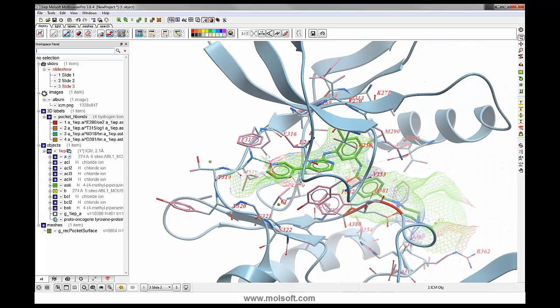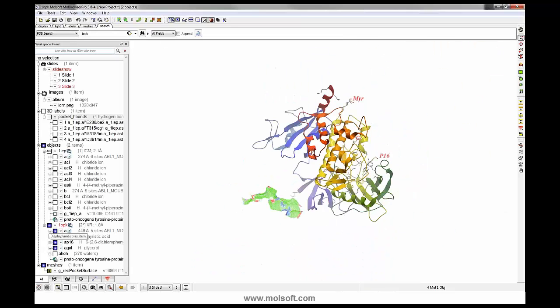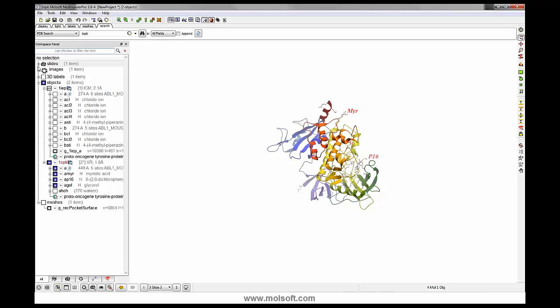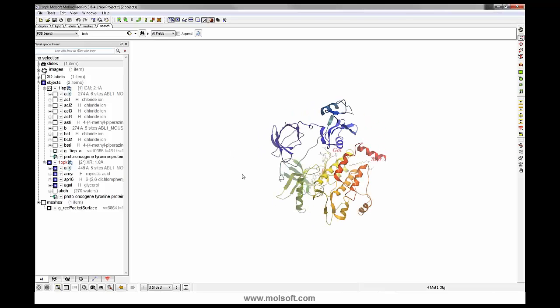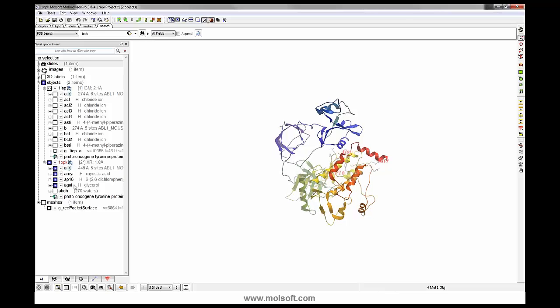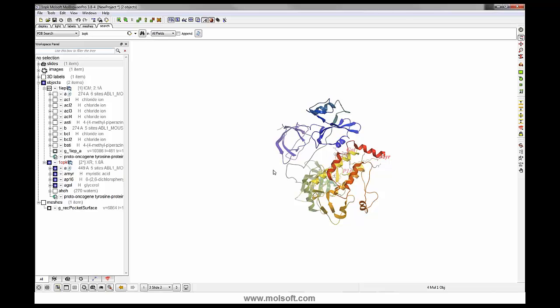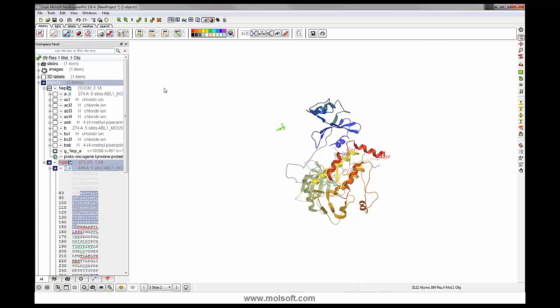Okay, so we're going to finally read in another ABL kinase from the PDB, and that has a PDB code of 1OPK. Okay. So now we have, just going to clean this up. You can minimize how much information you see using these plus and minus buttons. So this is another ABL1 kinase, and it only has one protein chain. It has a ligand bound to the ATP pocket in the type 1 conformation. So it'd be nice to compare the type 1 pocket with the type 2 pocket. This also has a long N terminal, which I'm sure is very useful, but I don't like it. It gets in the way of the images, so I'm just going to undisplay it here.